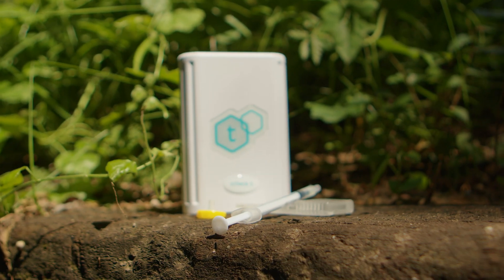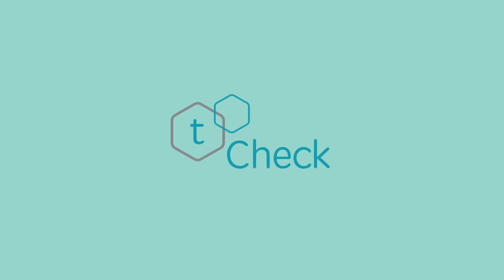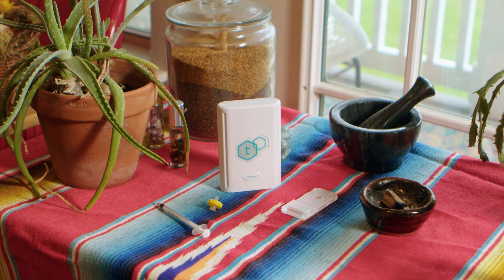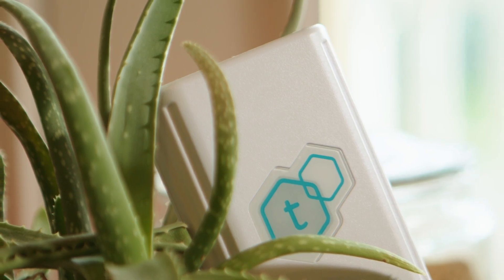Welcome to the future of accessible at-home potency testing. This is T-Check 3, the newest generation of T-Check's lab-grade potency testers. The T-Check 3 is the revolutionary potency testing device that puts the power of accurate cannabis and hemp testing right in your hands.